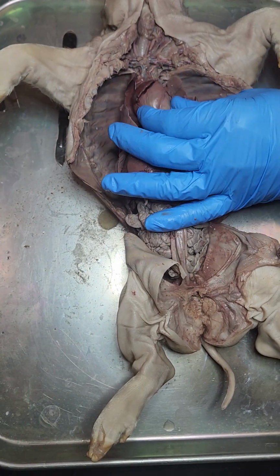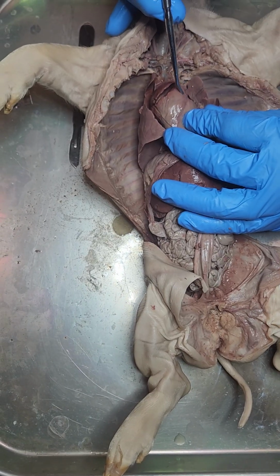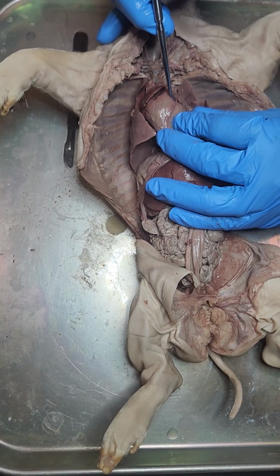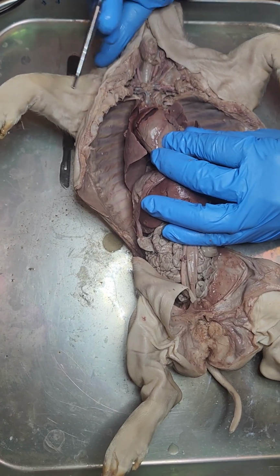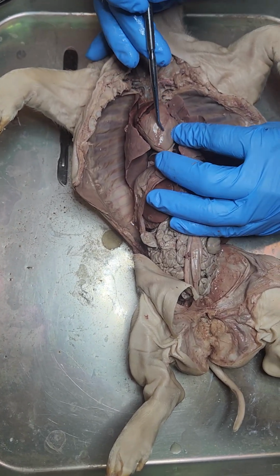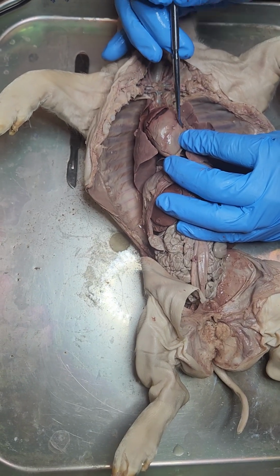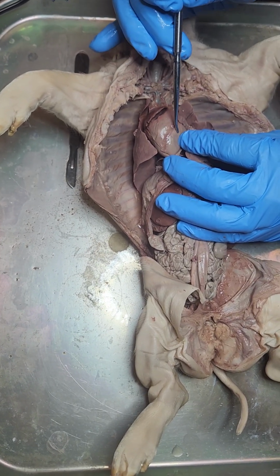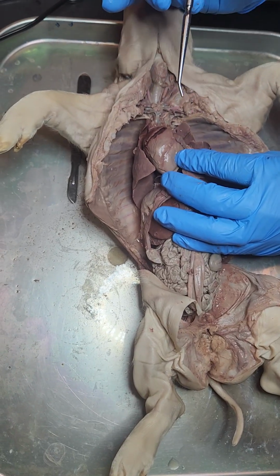Coronary arteries. Coronary arteries run across the heart like this. A heart attack is actually a blockage in one of these arteries. Okay, so you might have heard of a massive coronary event. That is a heart attack. And what happens is these get blockages in them. When they block, they can't supply this heart, this muscle, with oxygen, so it stops beating. That's why heart attacks are deadly.